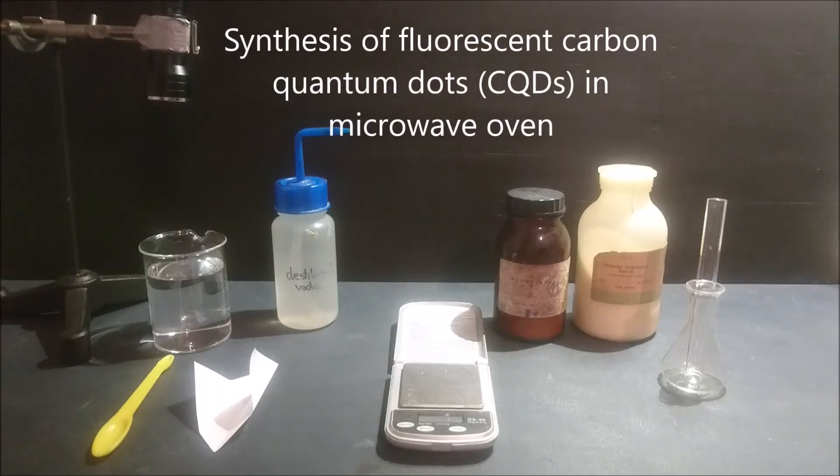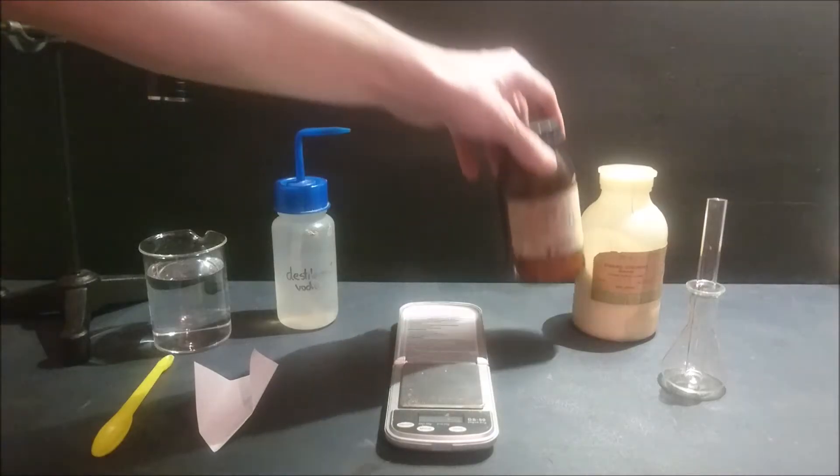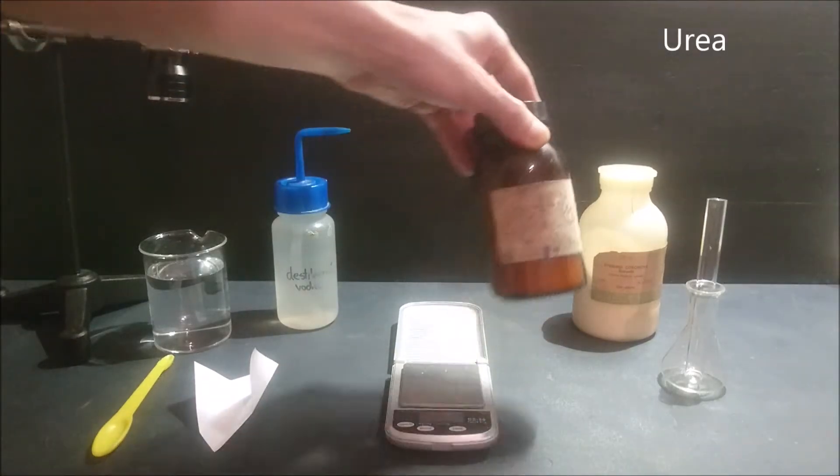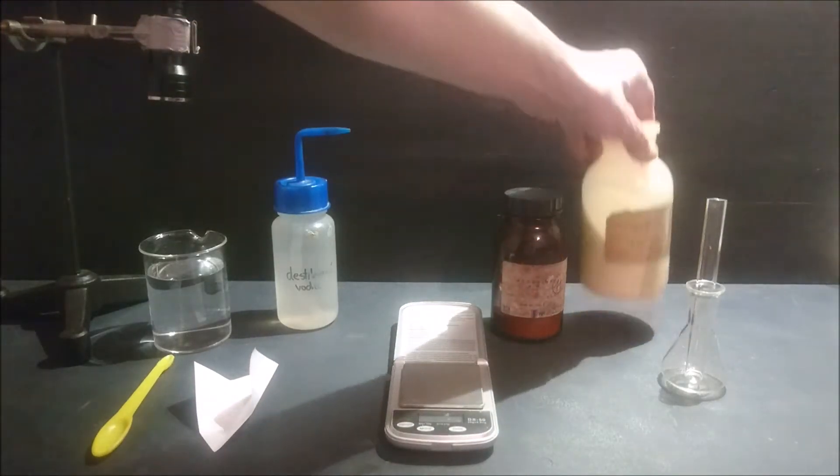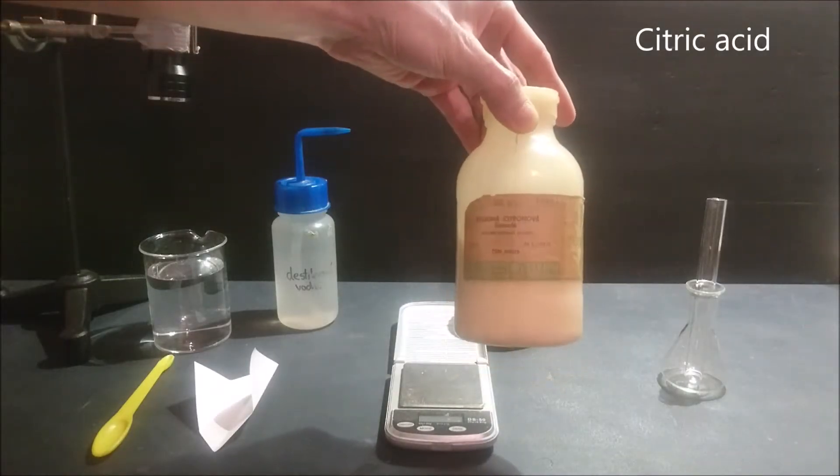Hi, I would like to show you how to make fluorescent carbon quantum dots from easily accessible reagents in a microwave oven. I will use urea and citric acid in this demonstration.